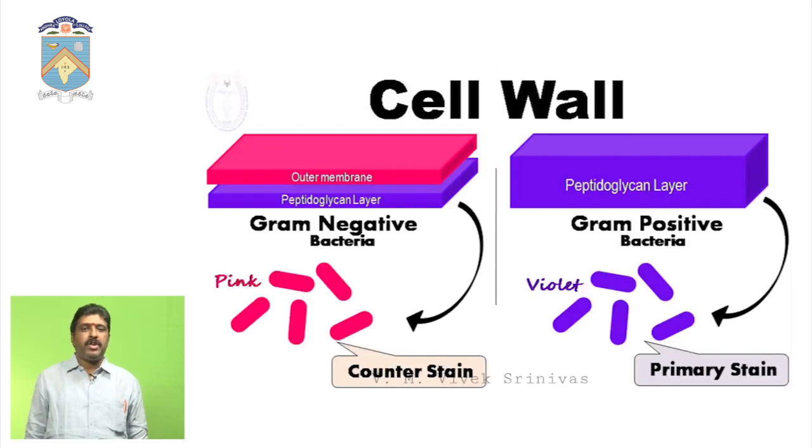And coming to the microscopic observation of gram positive and gram negative bacteria, there are different types of microscopes like simple microscopy, compound microscopy, phase contrast microscopy, fluorescent microscopy, and electron microscopy. The normal bacteria you can observe under the compound microscope with the 100x immersion objective lens, which is called the cedar wood oil objective lens. So, this is about the common differences between the gram staining and simple staining technique. One technique is used for the morphology of the bacteria, and the second technique is used to differentiate gram positive and gram negative bacteria. Under the oil immersion microscope, we can observe the microorganisms. Gram positive appears in purple color, whereas the gram negative appears in pink color. These are the common staining techniques.